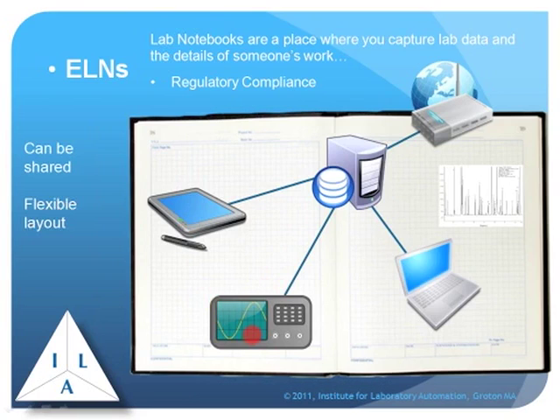You can bring information in from different types of instrumentation and record all that, and then also have access to the internet to bring in information from specialized databases. So it's things that you could have done manually. It just makes it a lot easier to deal with. It also makes it easier to share the information, and the layout can be very flexible.